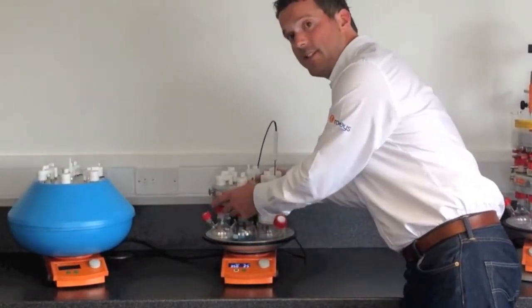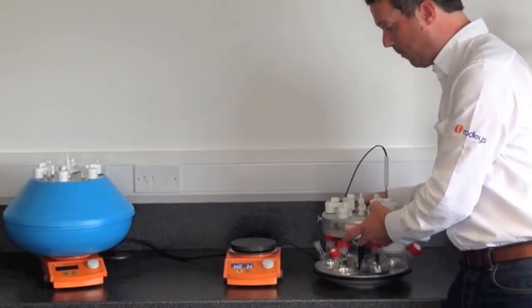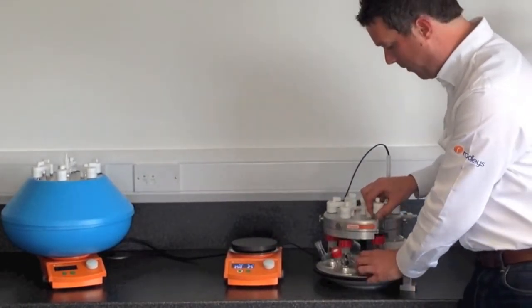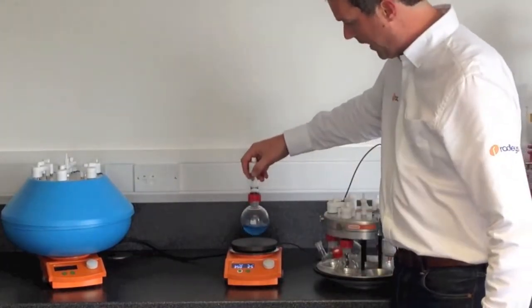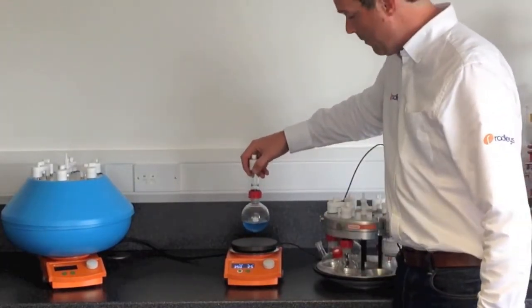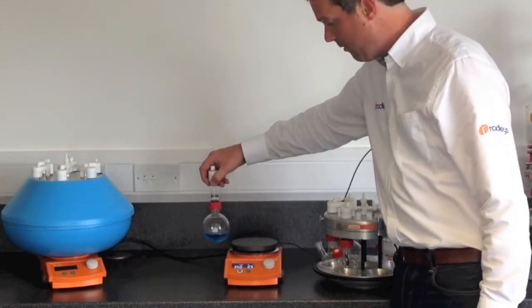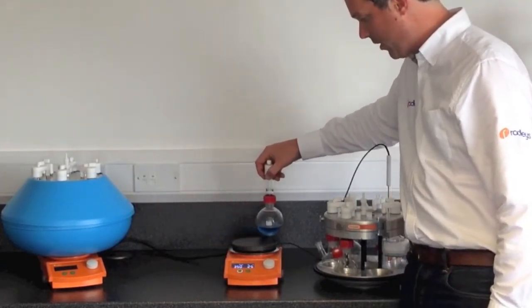The carousel sits on a standard 135mm hot plate. Normally if you set up a round-bottom flask on a hot plate, you'd set the flask up in the centre of the hot plate to get really good stirring. But the carousel works on the theory that you also get really good, even stirring all the way around the outside of the hot plate.